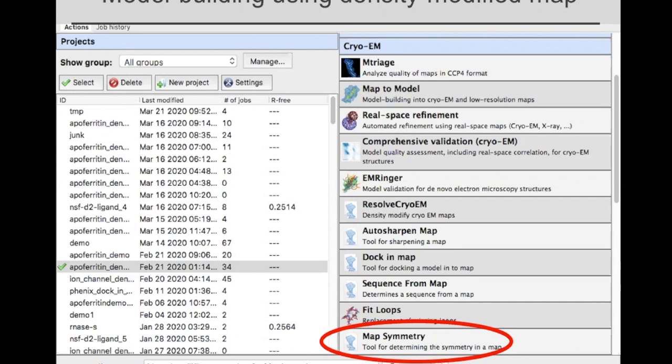The simple way to do it is you just spin the map along map symmetry axes, and find whether there's symmetry. It's really easy. If you don't have that, then you have to take a little sphere of density, try to find it in other parts of the map, find the relationships amongst all those, and then put it all together to get your symmetry. So that's harder, doesn't always work. But in most cases, you just find the map symmetry.